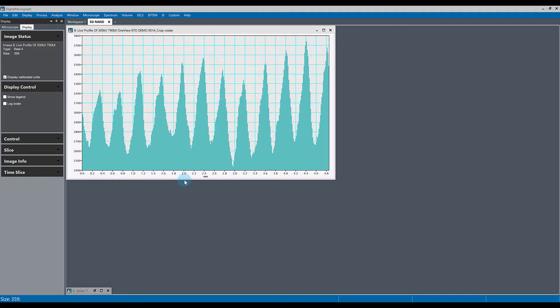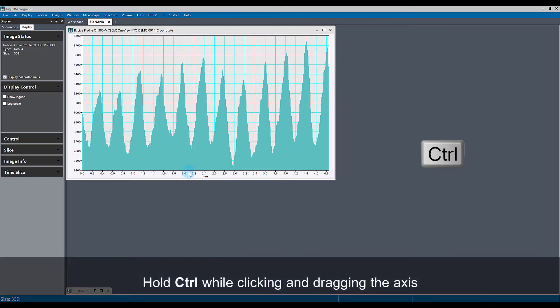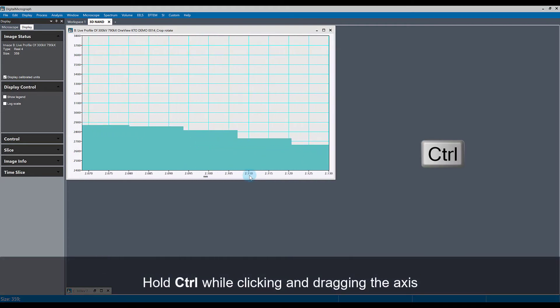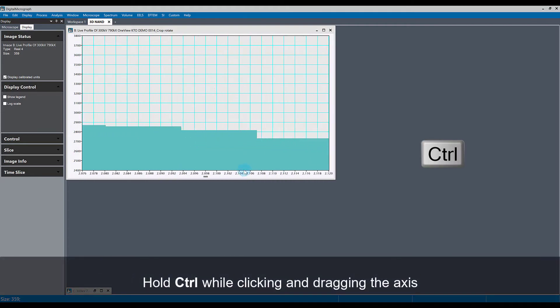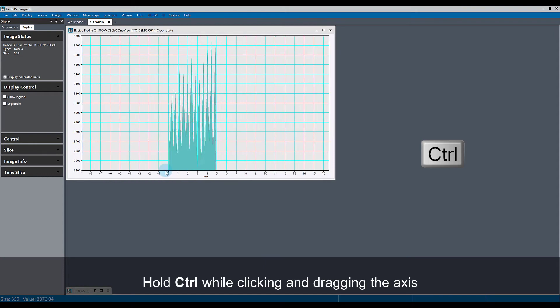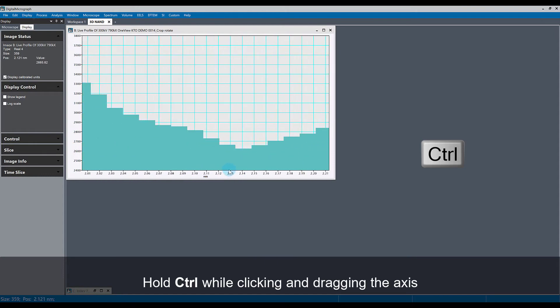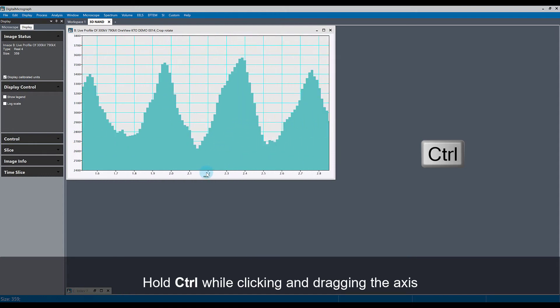You can do this by holding the control key while you left click on the axis and drag left or right to zoom in or out of the line profile. This works for both the X axis and the Y axis.